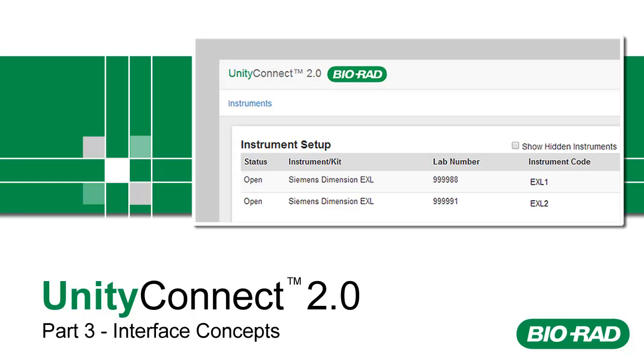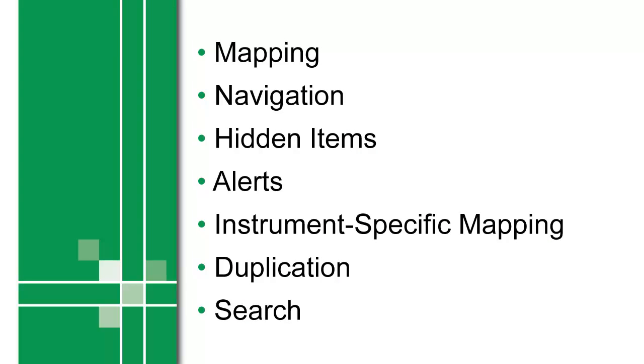Welcome to Part 3 of UnityConnect 2.0 training. This video focuses on these topics because they're applicable throughout the software. Once you've learned these basic concepts, you'll find using UnityConnect 2.0 very easy.